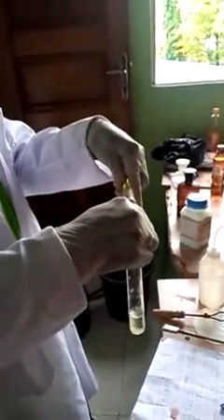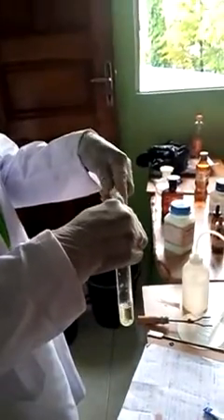Then the next one. What is the next thing? They say divide the solution into 3 portions. So we are going to divide this solution into 3 portions, just a little in each.